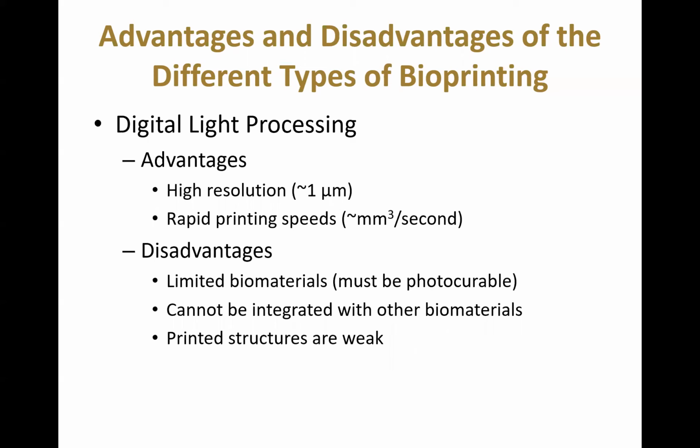Digital light processing, its advantages is it's fairly high resolution and more rapid print speeds. But some of its disadvantages is that there's a limited availability of the biomaterials that you can use because it must be photocurable. And it really cannot be integrated with other types of biomaterials. And again, as with the jetting type of printing, the structures are weak.